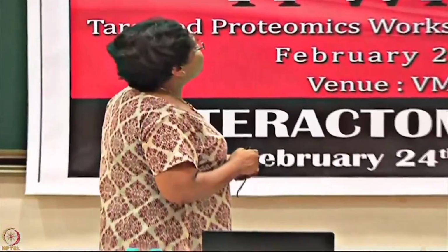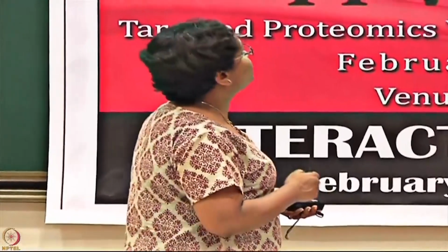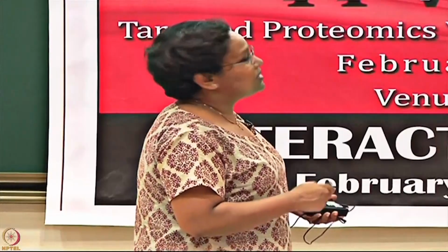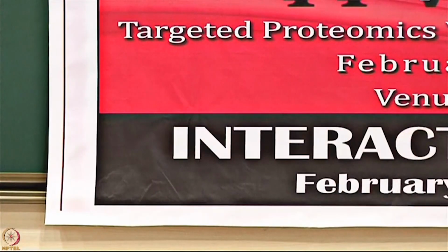So, when your analyte passes over the reference surface, you see a certain pattern of response unit. This is your active surface, and when you subtract, this is your real binding minus the non-specific binding.